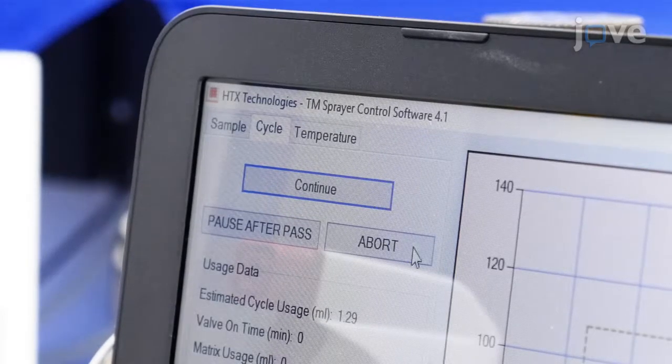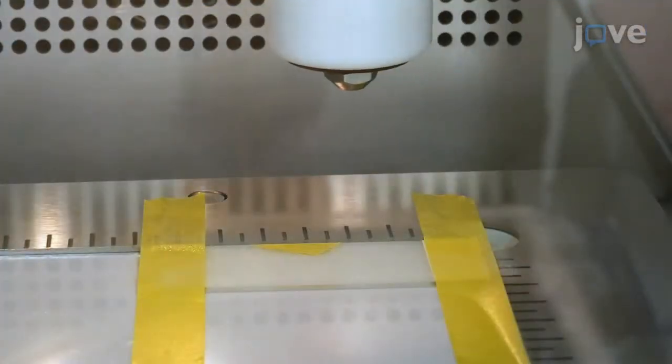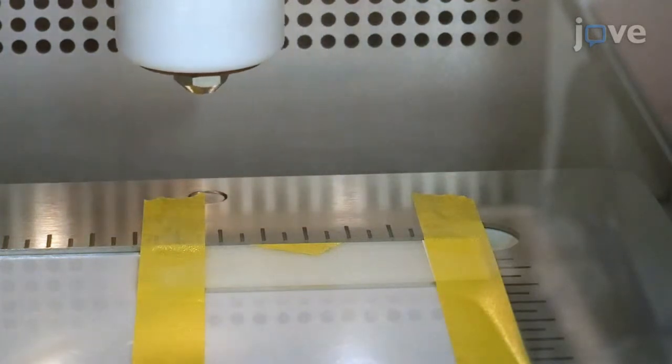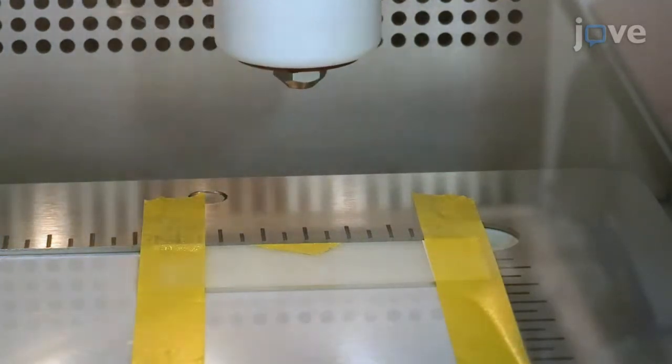Usually, prep time is around 90 minutes. The preparation will be regulated automatically via the monitoring of the matrix layer thickness and wetness.